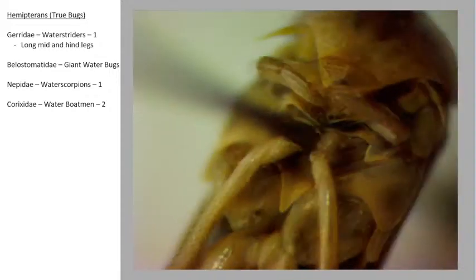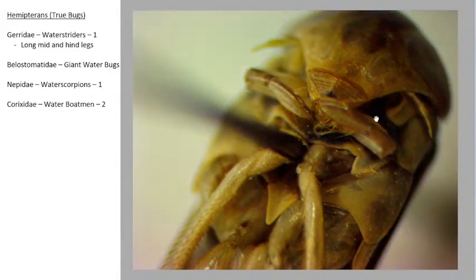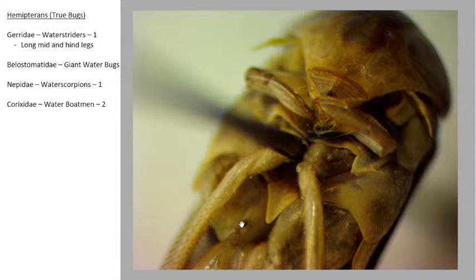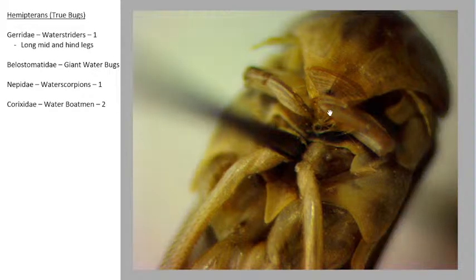Okay. Water boatman. Cool. So, if you look up here, this is his head right here. He's got one eye right here. His two eye is right here. It's kind of fuzzy and in the background. He has his hind legs actually connect about right here, so they're kind of going off screen. His middle legs are right about here. We will go and look at his hind legs for those hairs. But what I want to show you is his front pair of legs.